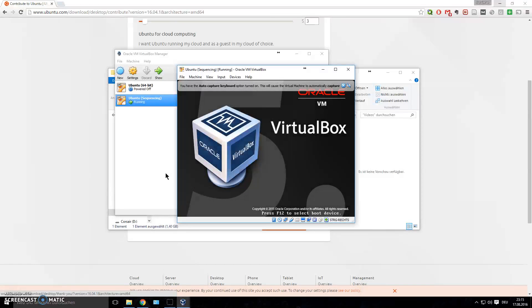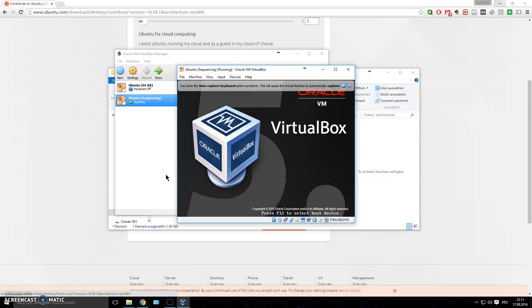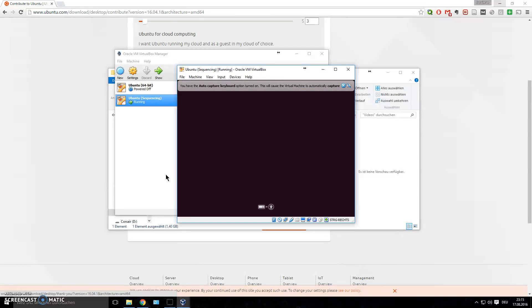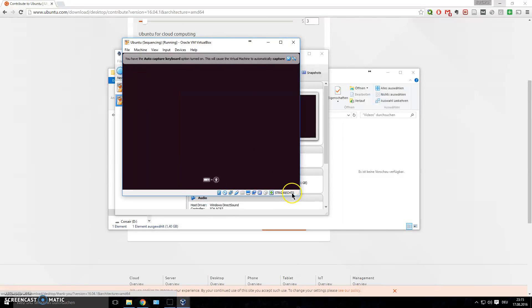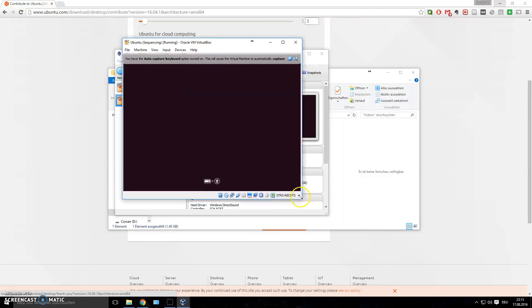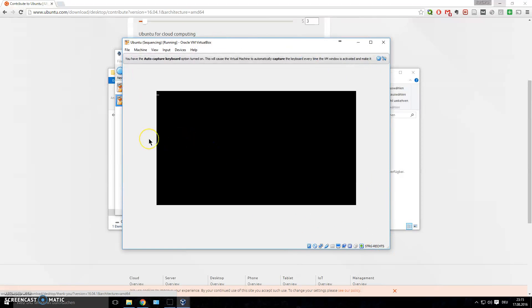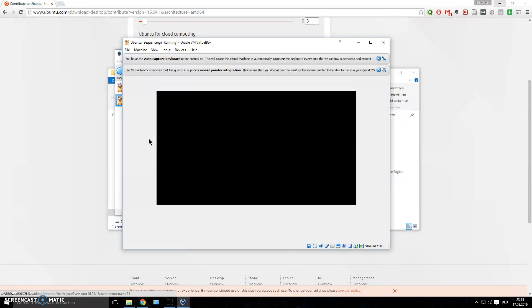Now power on the virtual machine by double-clicking it or clicking Start. What happens is you've pressed the power button on your virtual computer — it will start up as if it's a normal computer with an installation CD inside, and it will read that disc and take you through the Ubuntu installation process.